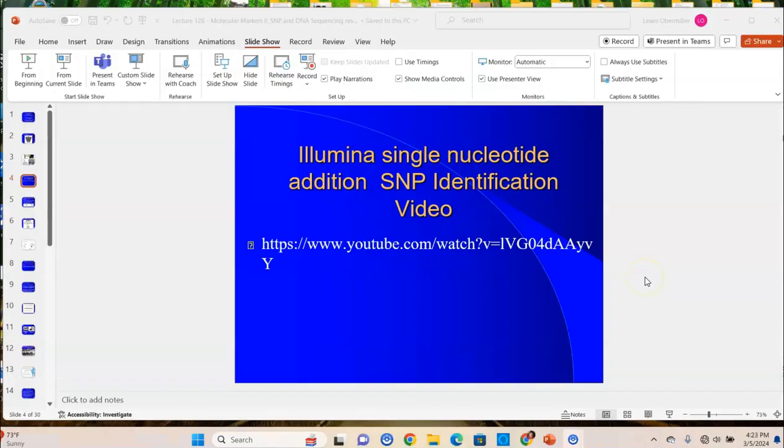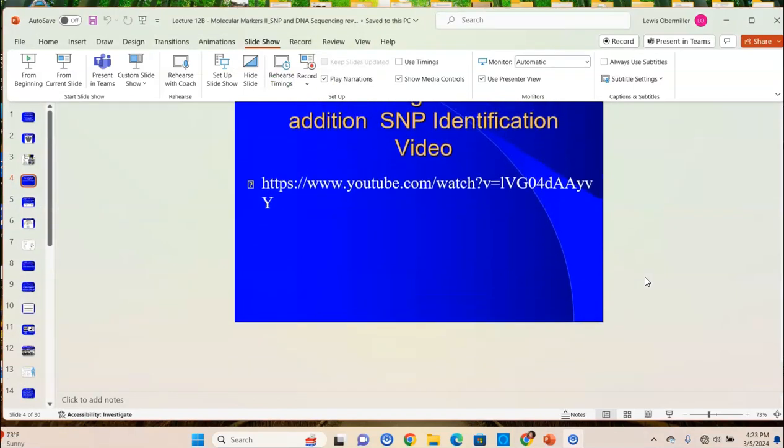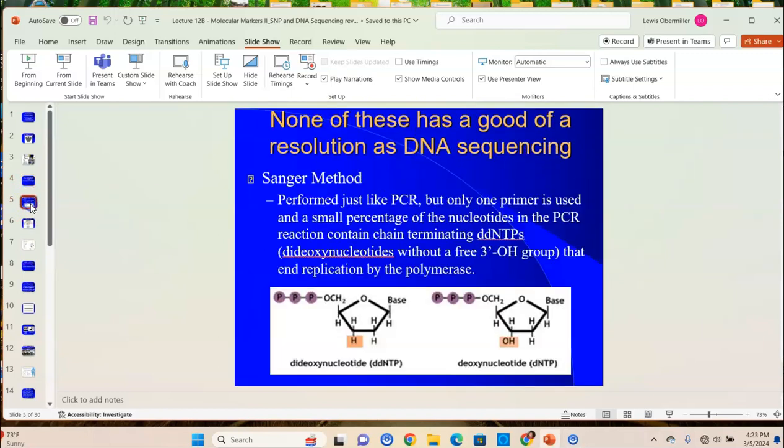Okay, so that's basically how the chemistry works. It's just basically detecting fluorescent signals on the end of those probes of DNA that are affixed to that chip. So SNPs can give you a lot of useful information, but it's not going to tell you areas that aren't commonly polymorphisms in the human genome. So, for example, let's say it's not common to have a mutation that creates some disease at a certain loci. So you would never know that by doing an Illumina chip. Illumina chip is just going to tell you areas that are variable in the genome of different human beings.